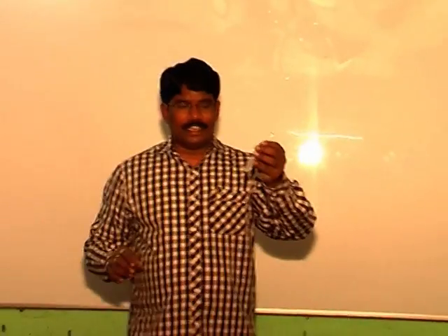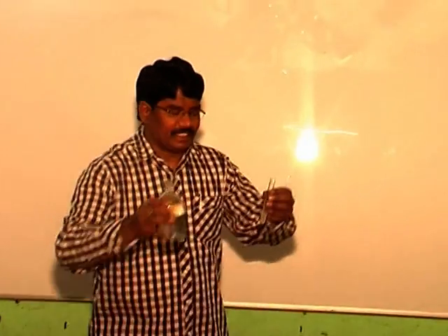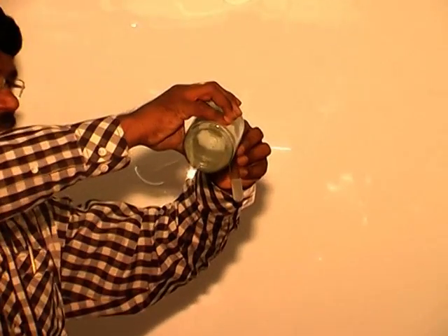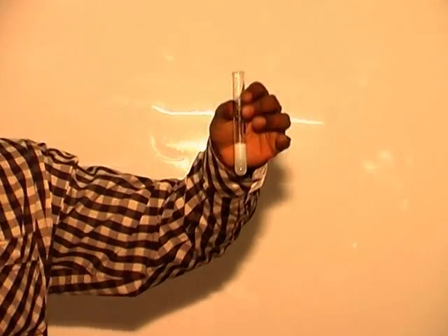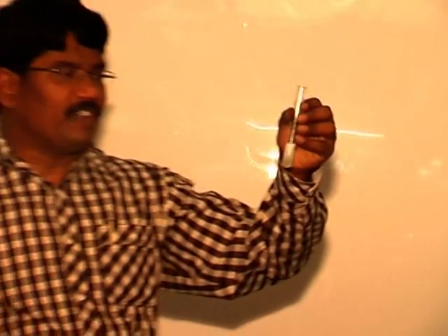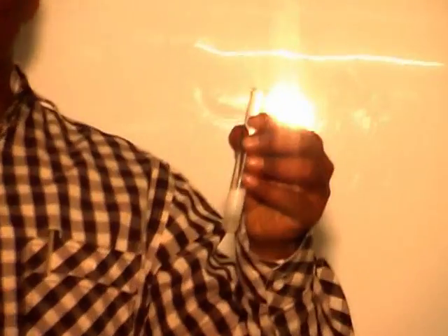That is lead. So in the case of this first group cations test, I am taking the salt solution and adding dilute HCl. Now the precipitate is formed. If the precipitate is formed in the identification of first group cations, then first group cations may be present, that is lead may be present. Then immediately we need to do the confirmatory test for this.